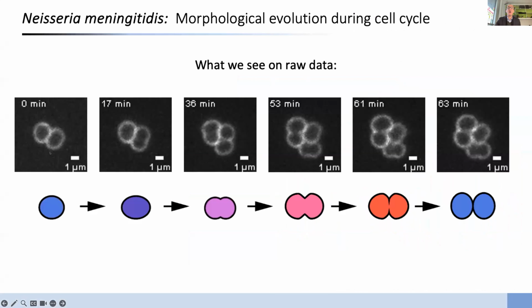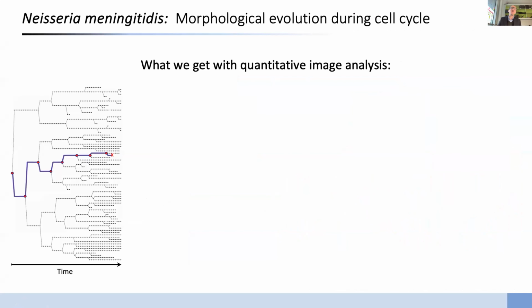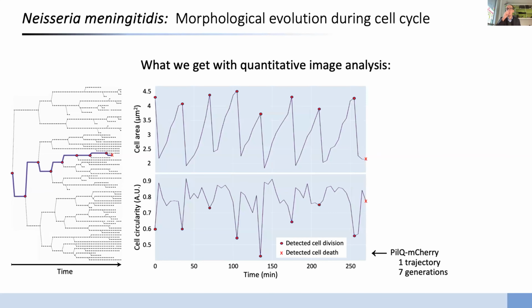And at the same time, you have morphological information, right? And so you can see a bacteria here, and that will grow and divide. It's kind of difficult to see here, but what we see here for the growth of the bacteria is that it seems to elongate. That's fine, because then you can pick one of the bacteria and measure the morphology based on the segmentation. And this is what we observed. That's the area over time for the bacteria. And it grows linearly, almost linearly, as you see, and every time there's a division, boom, the area is roughly divided by 2, and this reproduces.